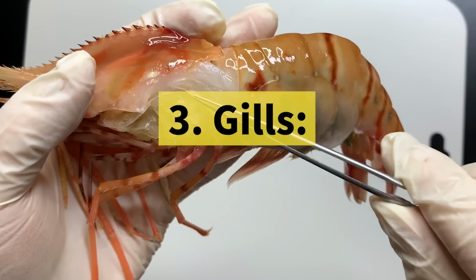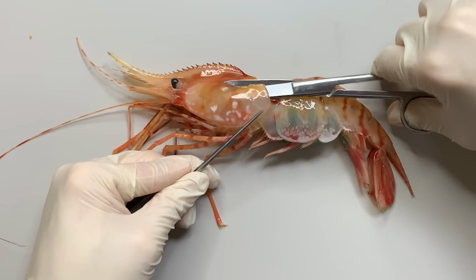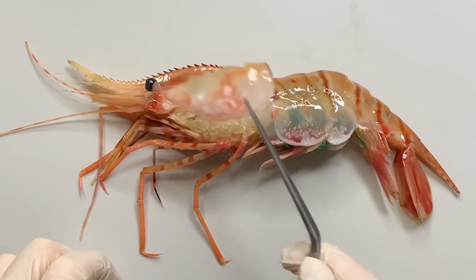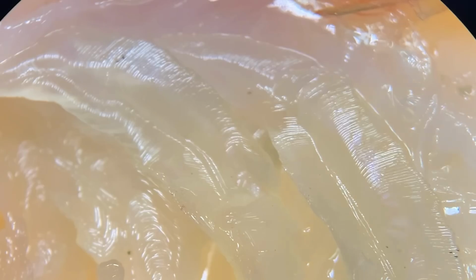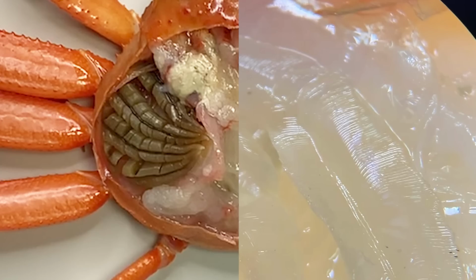The third difference is in the gills. If you remove the cephalothorax shell of a Higoromo shrimp like this, the gills are located inside. Upon closer inspection, you'll see the gills of Pleocyemata shrimps are shaped like stacked plates. This is quite similar to the gills of crabs within the same suborder, isn't it?